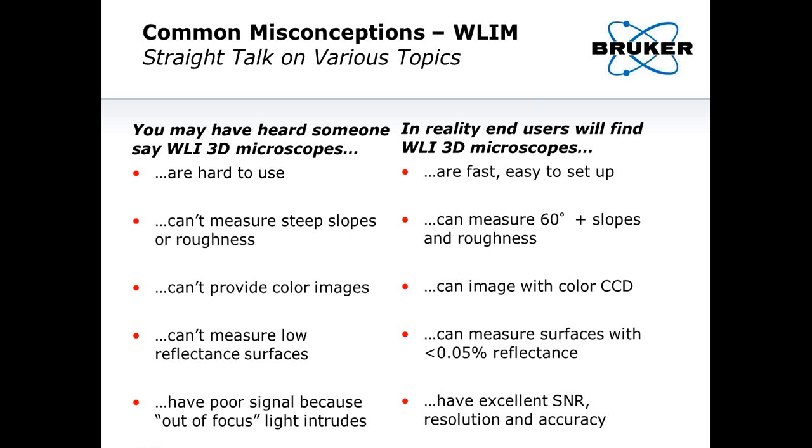It's interesting to me, in reality, having an optics background and thinking about the systems in general, a white light interference-based system can also be thought of as a confocal technology. The only difference is instead of using a pinhole to keep the confocality, you're using the light coherence to keep planes of equal focus, or confocality, being compared. And it's one way to consider that they're really not that different if you think in a broad sense about what is being used to make the height maps. It's just a different way of dictating what surfaces are in comparison at the time and are confocal.